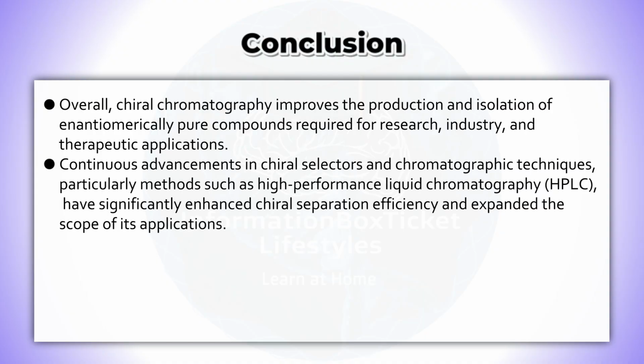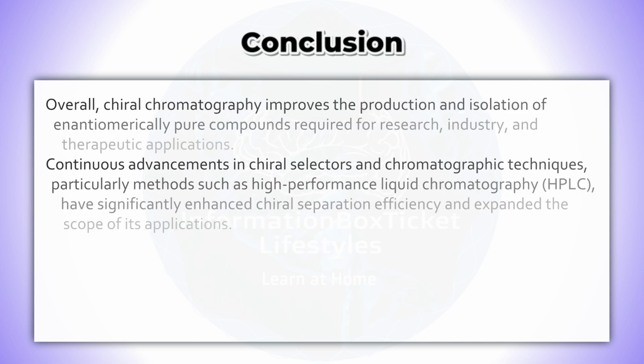Continuous advancements in chiral selectors and chromatographic techniques, particularly methods such as high-performance liquid chromatography, HPLC, have significantly enhanced chiral separation efficiency and expanded the scope of its applications.